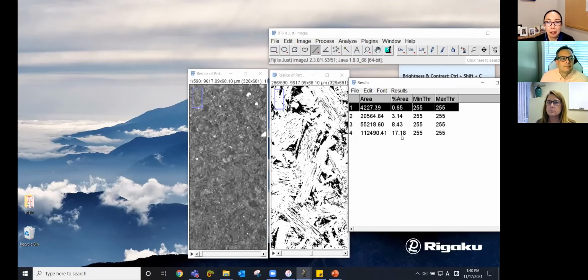I think there are a couple different ways to interpret this statement, meaning that a software company might create something that's open source, an ImageJ commercial version in a way. ImageJ was originally made by NIH, and it was and still is meant to be open source. So if you make a commercial version to sell ImageJ, I am not aware of that.